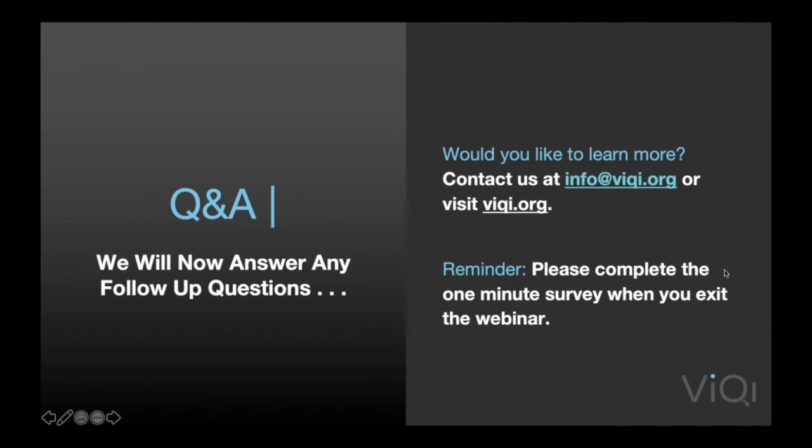So let's get started. Ilya, we have a question here that says, how much data is enough data to train the AI? Right, so that's a very common question. And the answer to that, so I specifically, well, maybe you saw a hint of how many samples were being used in training. The real answer is that you don't know.